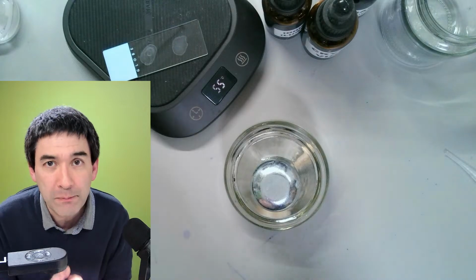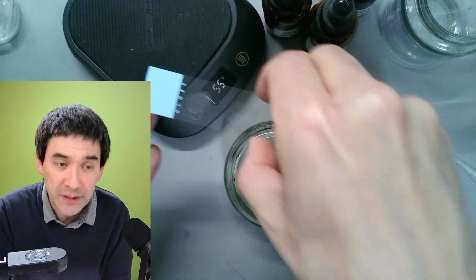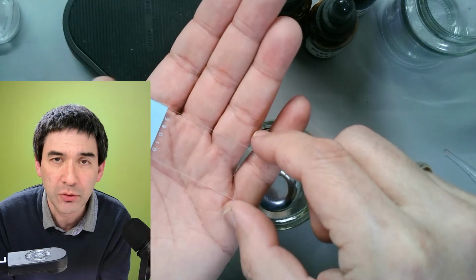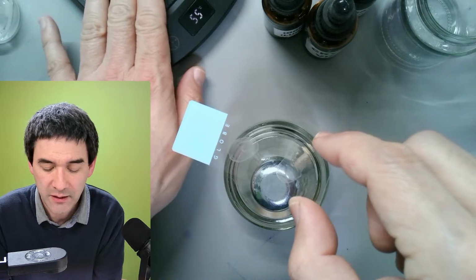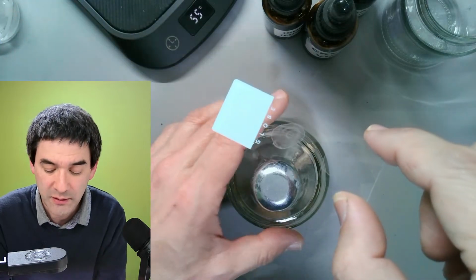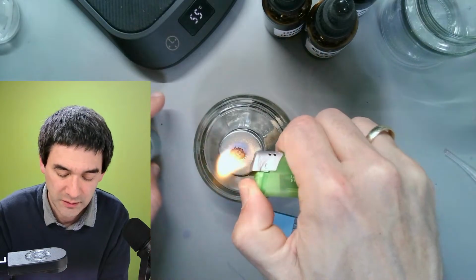How hot should it be? There is a general rule of thumb that says after the heat fixing, you should be barely able to hold it in your hand without burning yourself. And I just realized that essentially it was 55 degrees, it was already kind of warm. So I hope that this actually didn't hurt the cells either. Okay, so we're gonna do that.